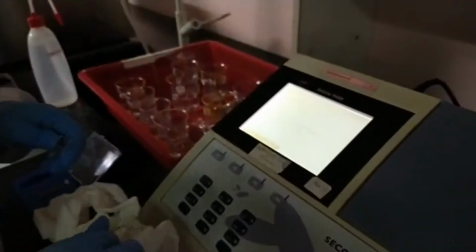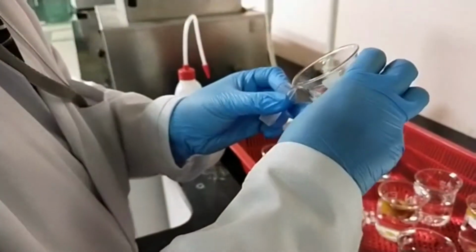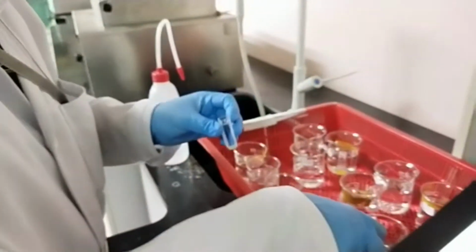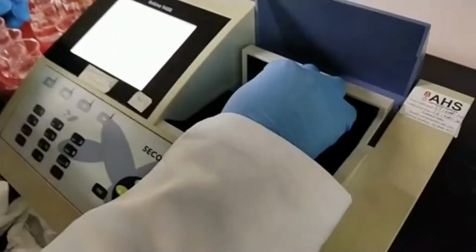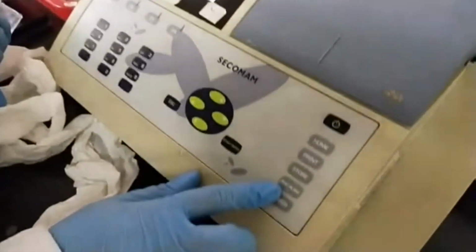Okay, so we're going to start with 3.2. So this is the buffer alone without the addition of furosemide. Press 0 for blanking.